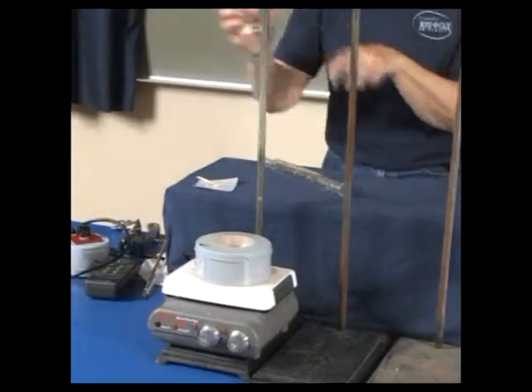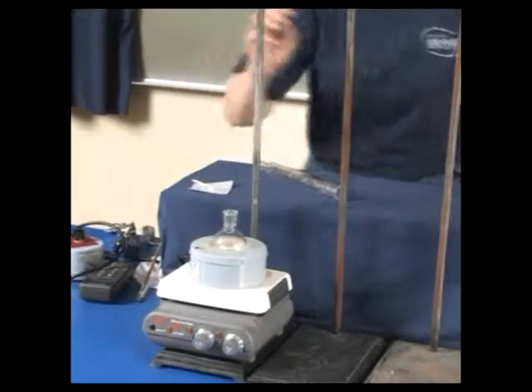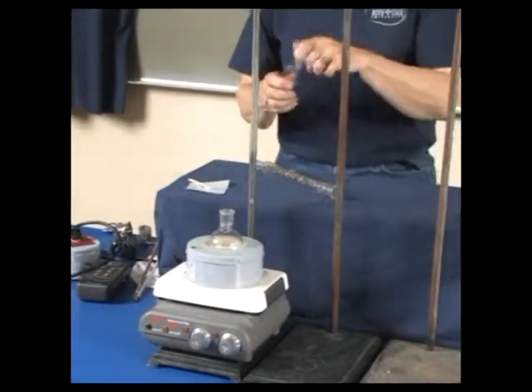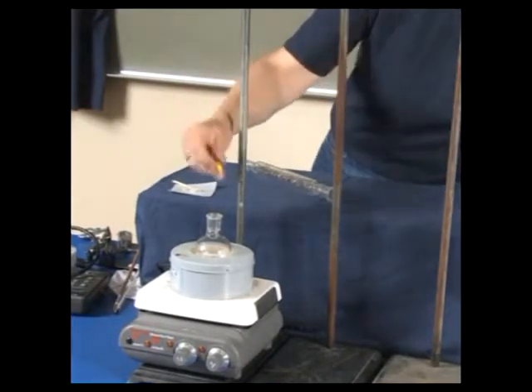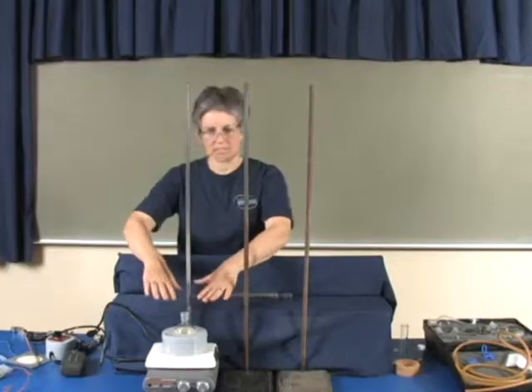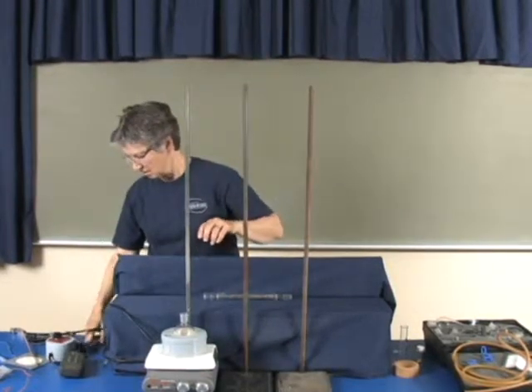In this case, we're using a 100 ml flask, and at this point it's also a good idea to add your sample. Be sure you add a magnet to act as a stir bar. This determines the height of the apparatus.